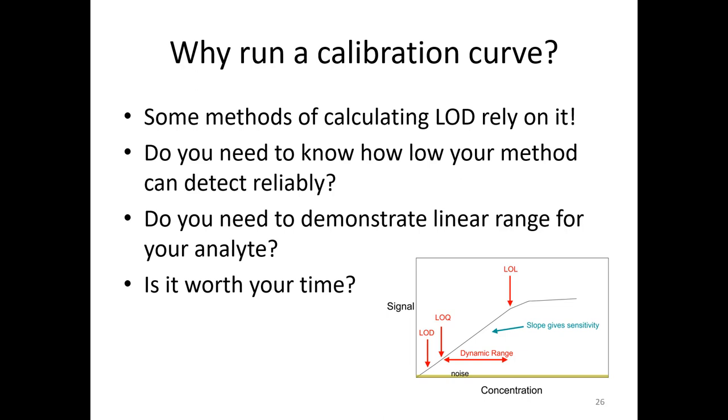But the point is you generate something with a range of concentrations and see what the response changes over that concentration range. So what's important to note is how low can you get? Can you get to a zero spike level and see zero peak areas? I never see zero peak areas. It's very, very rare. The only time I do is when I'm spiking my standards into solvent, right? If you have a chemical matrix like plasma or cell lysate or BSA even, there's usually some non-zero signal here, and so what will happen is this will bottom out, and it's now not linear.